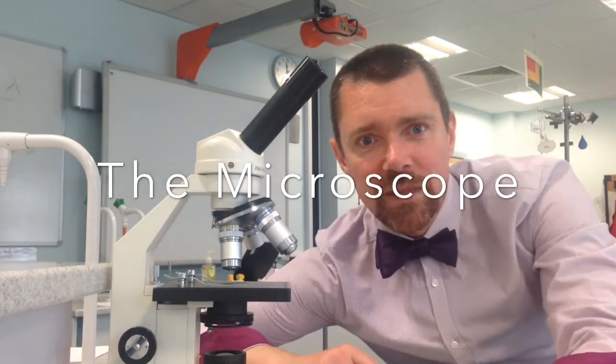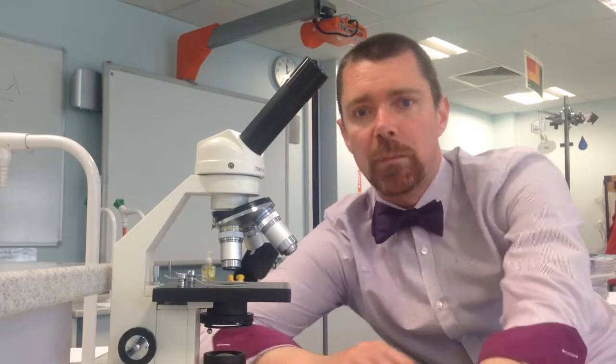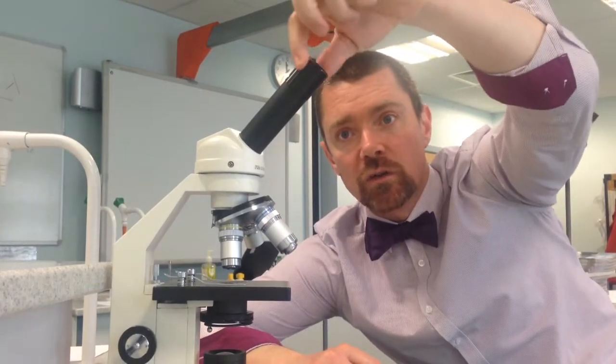Hello Year 7! Welcome to our introduction to this fundamental bit of biology kit, the microscope. First I'm just going to tell you the names of a few of the bits. At the top here we've got the eyepiece lens, which is the part of the microscope that you peer into.